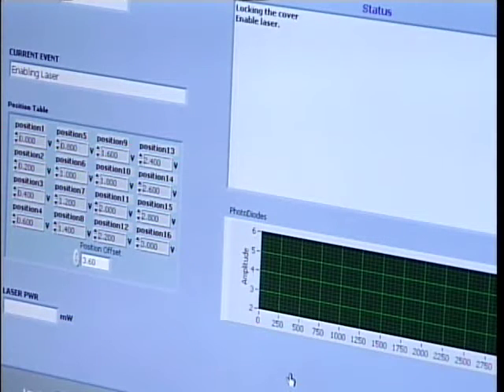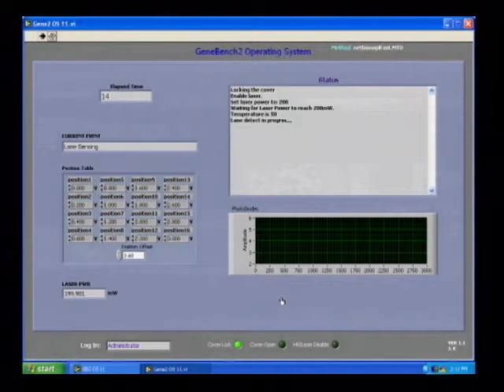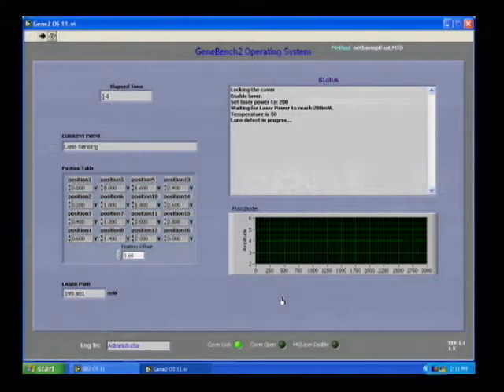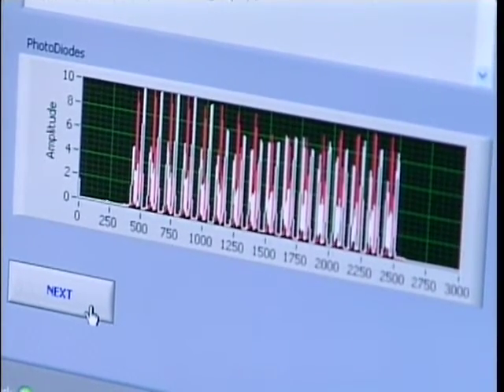On conclusion of pre-electrophoresis, the computer advances to the next step: lane finding. Since every run requires a different microfluidic biochip, the laser and detectors must be aligned to each of the channels. The lane finding process does this automatically — the laser is scanned across all 16 channels, detection signals are picked up, and the center of each lane is determined. The computer has confirmed that lane sensing is successful across all 16 lanes.